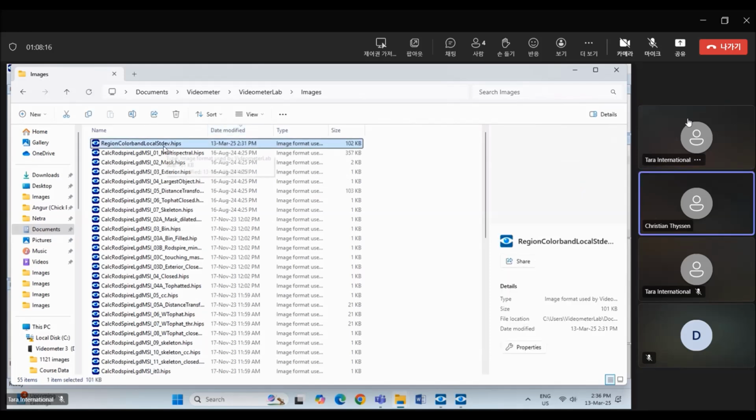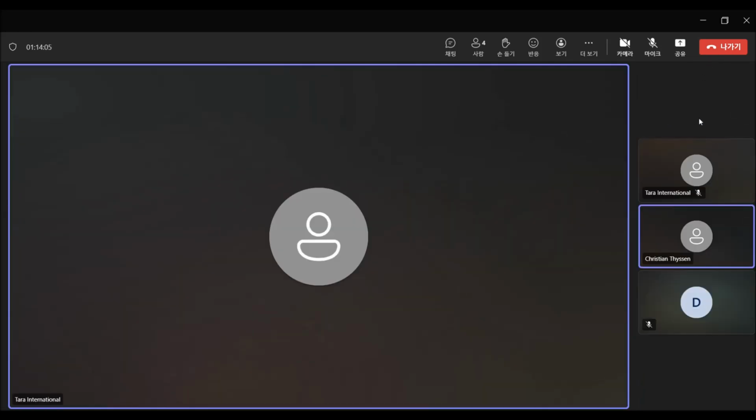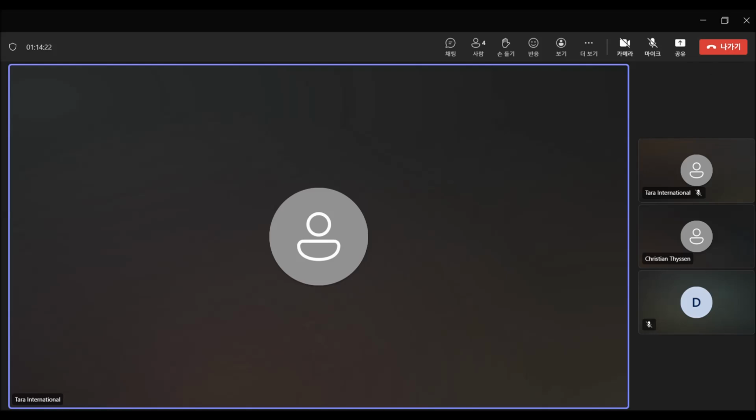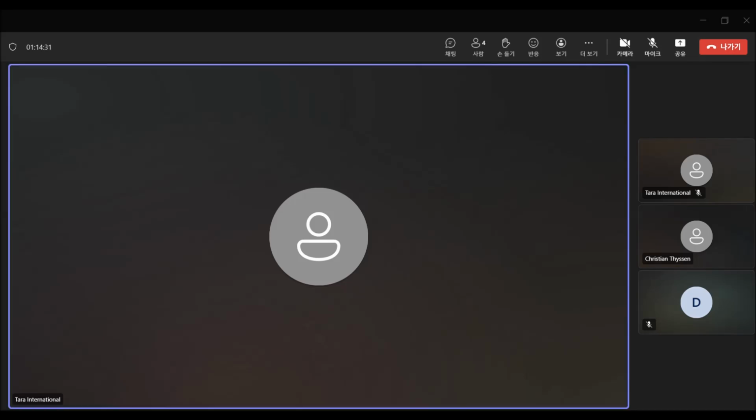Oh, this one. Yeah. I do recommend that you update to the newest version of the software, because in this version the debug images were saved in the default workspace. In the new version, it saves them in your current workspace. Okay, understood. Thank you. No problem. I was looking for the one that device is saving, and it's saving another one, but it overlaps. Yeah, unfortunately. So it basically saves the background of whatever features we've applied, right? Exactly. Okay. I think we're done with the exercises as well.